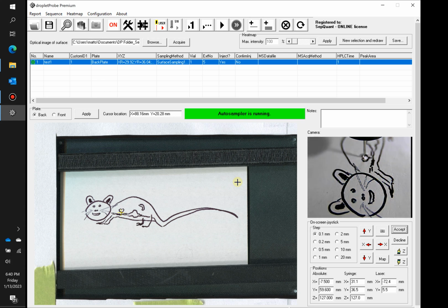Here's the droplet. And then it sucks back in. That was intentionally more than I like to put down on tissue. At least when you're doing method development, it's fine. But when you're optimizing a run, it's probably not going to be that much.